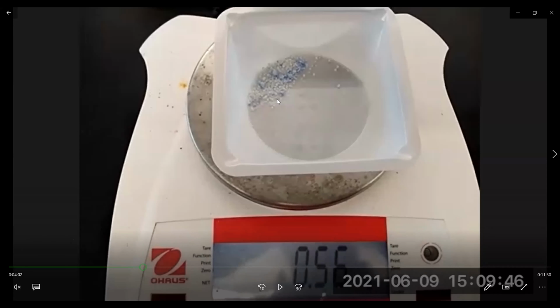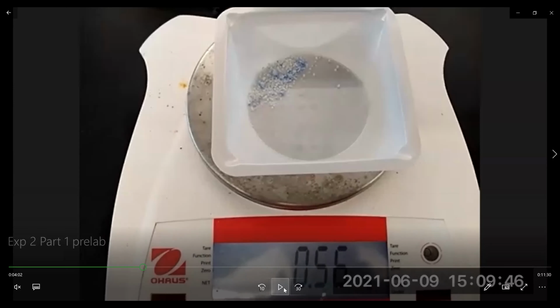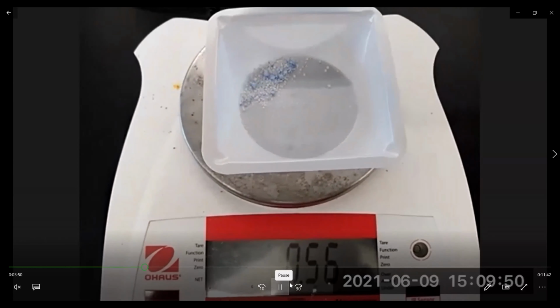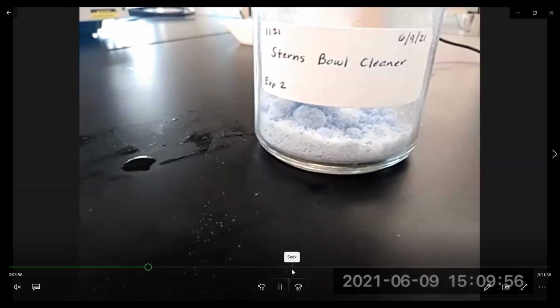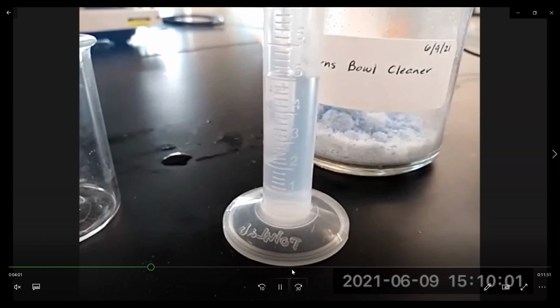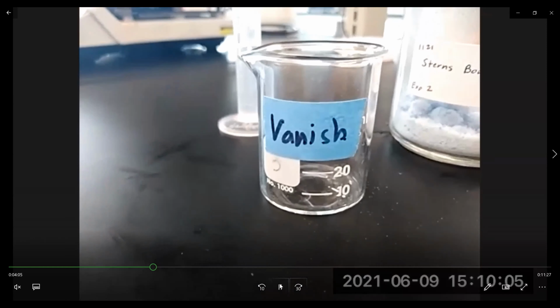Next, we take the Vanish crystal bowl cleaner, which is a blue white powder, and you weigh out about half a gram of the crystal bowl cleaner because it's a solid material. And we're going to add it to about 5 milliliters of water to make a solution of the Vanish.